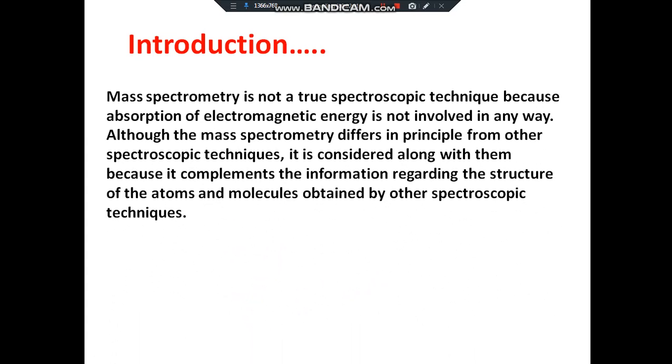Mass spectrometry is not a true spectroscopic technique because it doesn't involve the absorption of electromagnetic radiation, just like UV, NMR or IR spectroscopy. But anyhow, it is a supporting technique to elucidate the structure of a molecule.